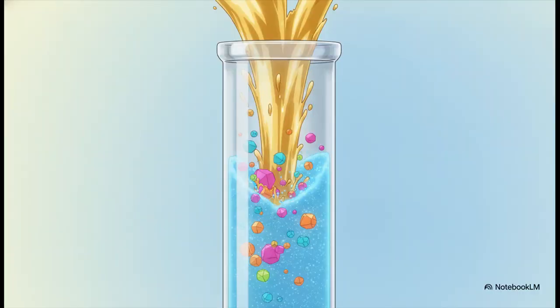Then there's the other half of the magic, the mobile phase. Now, in a traditional reversed phase setup, a highly organic mobile phase would just flush everything out instantly. But in HILIC, we do the exact opposite. We intentionally use a highly organic mobile phase. We're talking greater than 60% acetonitrile, combined with a smaller percentage of water and carefully optimized buffer salts. That high concentration of acetonitrile is literally what forces your polar analytes into that stationary water layer. Meanwhile, those buffers, things like ammonium formate, are absolutely critical for controlling the pH and keeping those secondary electrostatic interactions in check so your peaks stay nice and sharp.